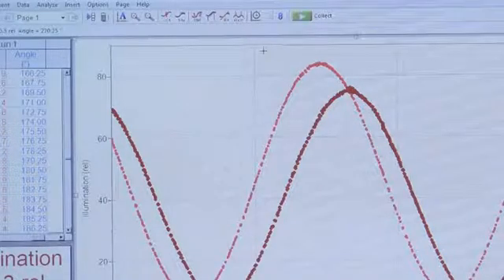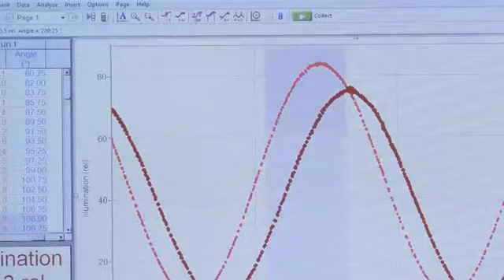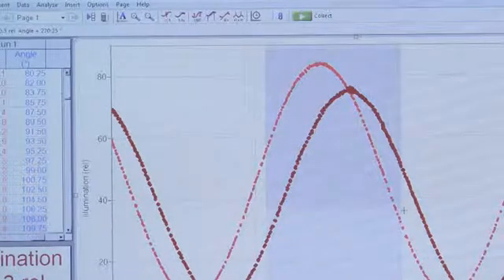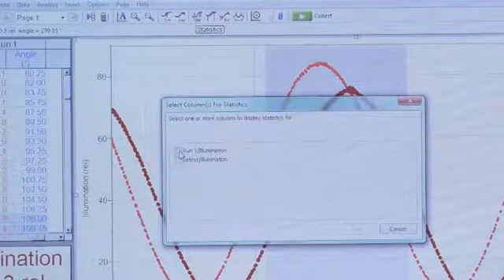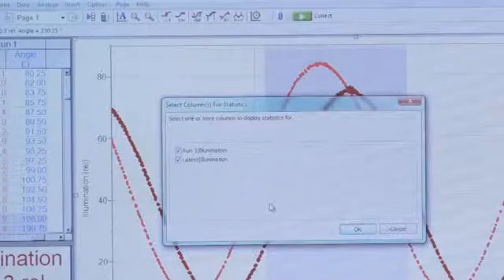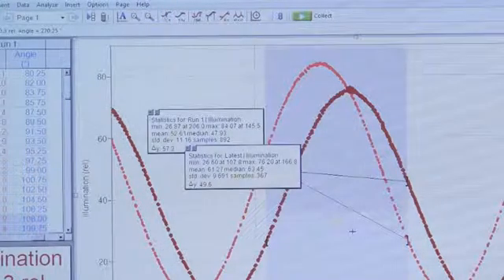To do that I select the first peak after angle 0 and tap on the statistics button. I want to analyze both the blank and the sample at the same time. Select OK.